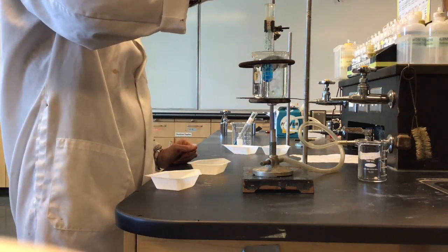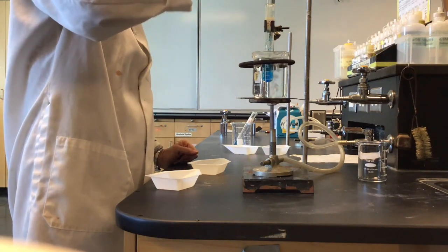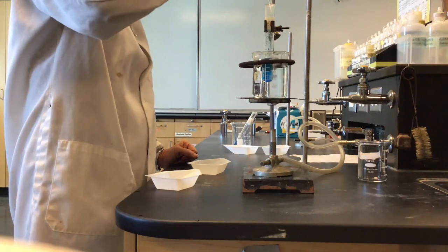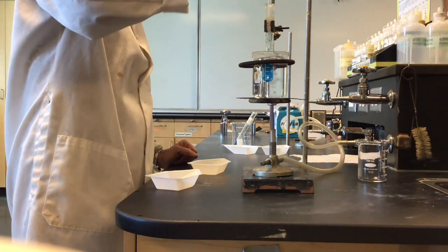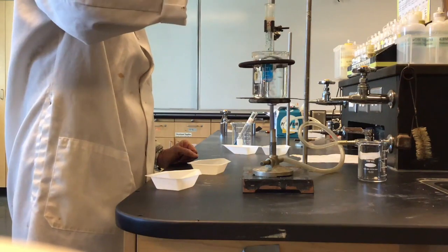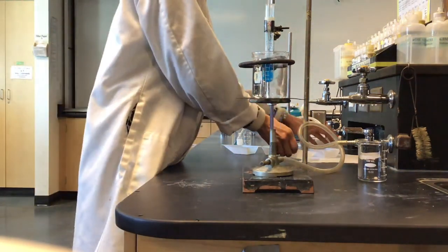You can see that a little bit of it's sort of sticking to the sides. I'm just going to use my stir rod to push down any of that copper sulfate that might be stuck on the sides. You also want to be careful not to spill any of it in the water, because we can't account for that mass when we're trying to determine the mass that actually dissolves in the water. And it looks like number 5 dissolved pretty easily as well.